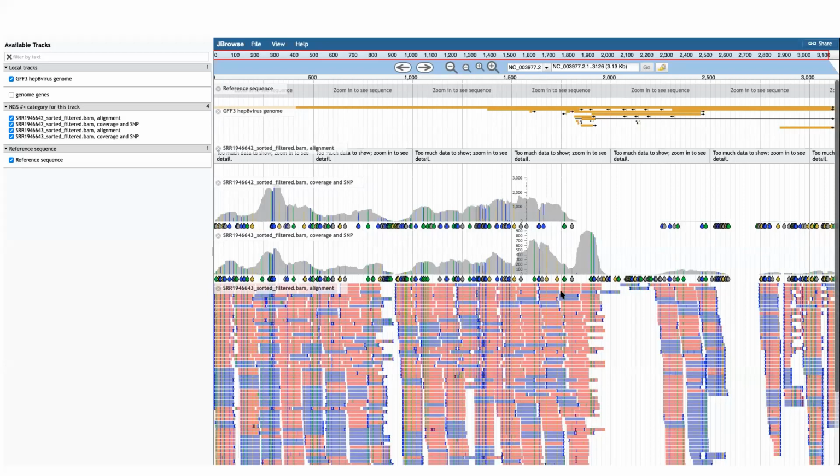This is just the beginning of that analysis. And hopefully by going through the SF9 project, you'll see some additional steps. For example, one challenge is just identifying presence of a virus. Another one is to determine whether that virus is the actual hepatitis B or whatever other virus you suspect it is, or maybe it is something else that is just a little bit different.